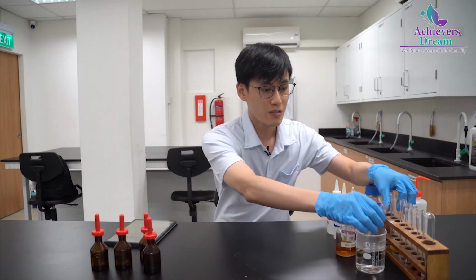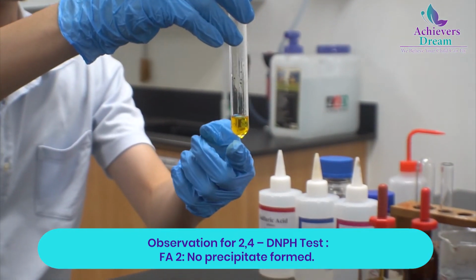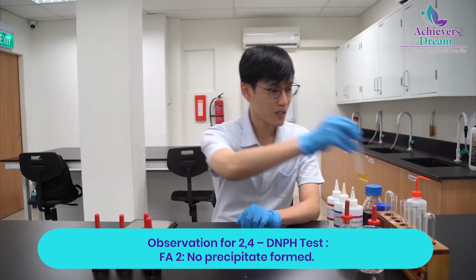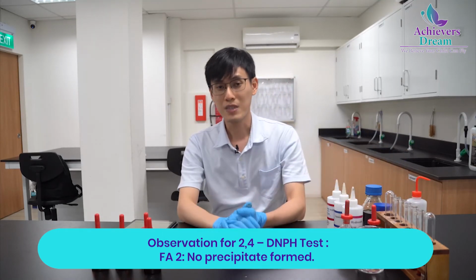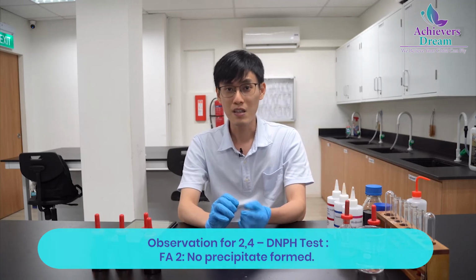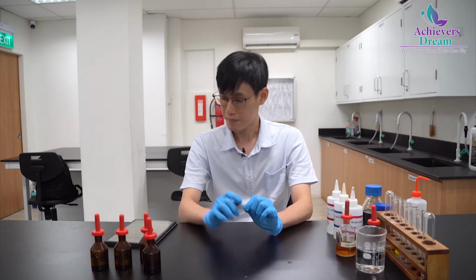So just to check on the water bath now, as you can see, there is no precipitate that's formed. So for Fa2, no precipitate, that means there's no carbonyl group present. But for Fa3, we have a precipitate, that means you have a carbonyl in Fa3.